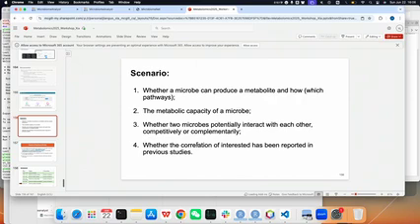The difference is that in either MicrobiomeAnalyst or MetaboAnalyst, we have tables. But for MicrobiomeNet, we only allow a single metabolite or a single microbe as input, because by this step we already have more understanding of our data.